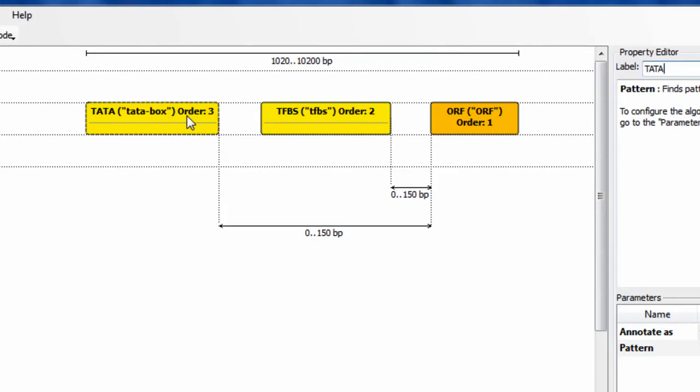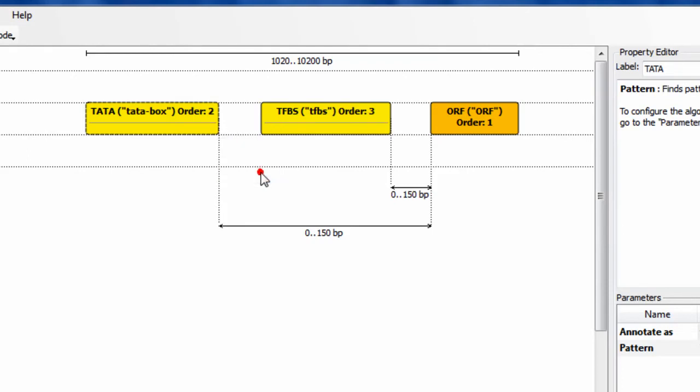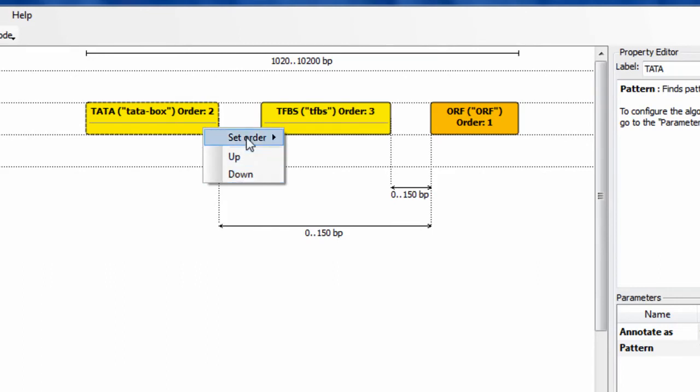If you want to add an algorithm, you may need to change the order. To maximize efficiency, algorithms finding the minimum number of results must go first. To change this setting, right-click on the algorithm and either select up or down items to increment-decrement the order number or set the order number manually.